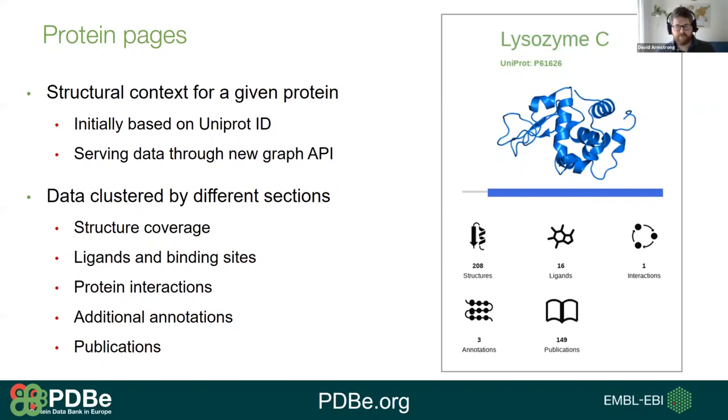how many different protein interaction partners there are, and again, all the interactions between those. There's also a section for any additional functional annotations, particularly those that are developed through other PDBe-KB partners. And we also provide publication information as well, just to allow you to get a more rounded view of the protein.